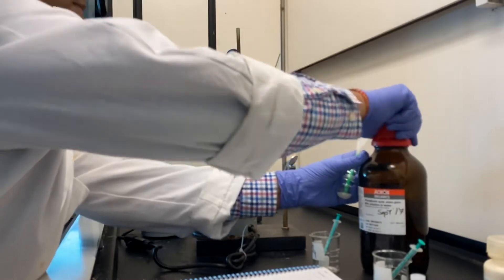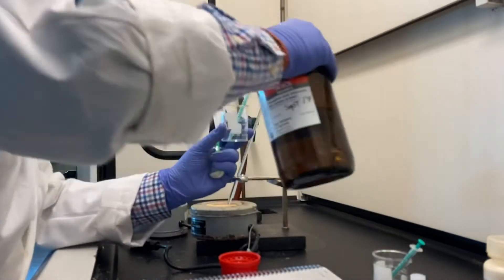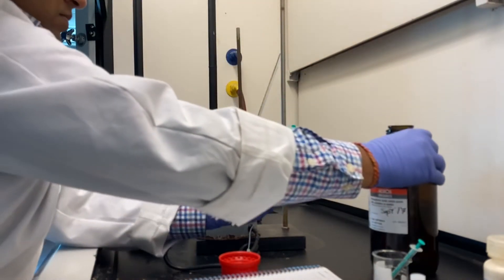Using a separate syringe, add phosphoric acid as well. Remember, phosphoric acid is very corrosive, so be careful.